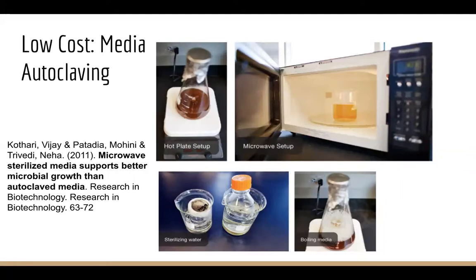because it might be that there's not an equal temperature throughout the sample. And so you get some parts of the sample that won't be 115 degrees C. So you've got to let a little bit of air out so the media itself can boil up and through the media, and so push out anything which hasn't been 115 degrees C.